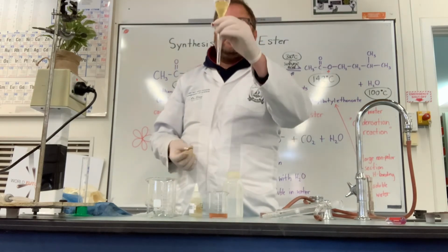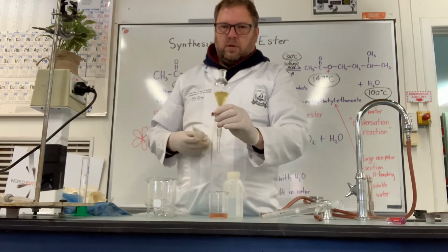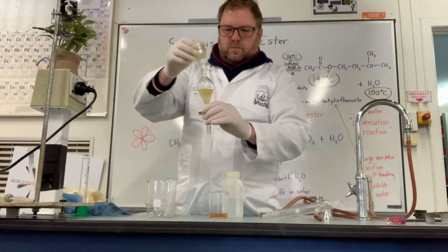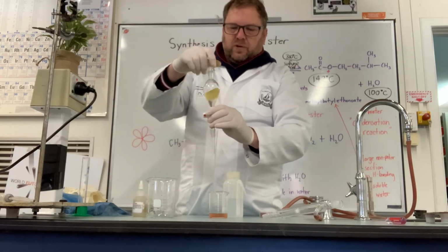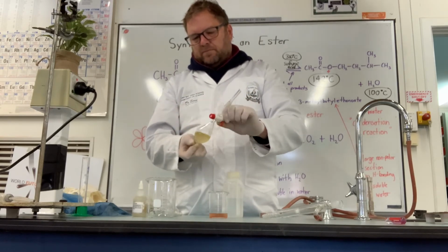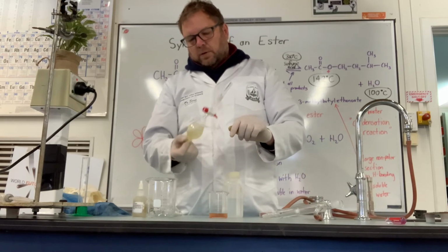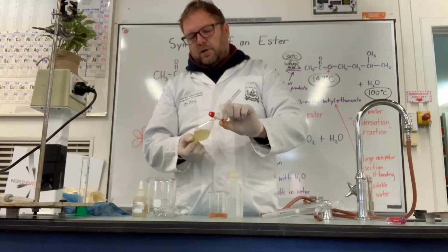And I'm just going to repeat that once more. We don't know if the fizzing stopped because we ran out of carbonate or we ran out of acetic acid in there. So I still get a little fart, for lack of a more technical term. Ooh, bigger one that time.